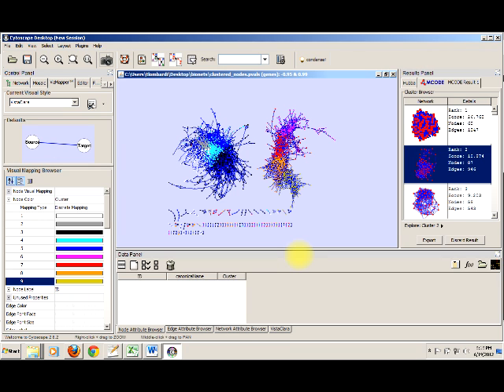The tool gives you lots of ways to analyze and visualize data. In summary, today we've talked about how to take gene expression data and reformat it with Java so Cytoscape can read it. We've learned about the SIF file format, the node attribute NA file format, and the pvals format for expression data. We learned how to import those, how to do hierarchical clustering, how to create networks, and how to do basic analysis with tools like mCode, metanode, and the VizMapper. Have fun!